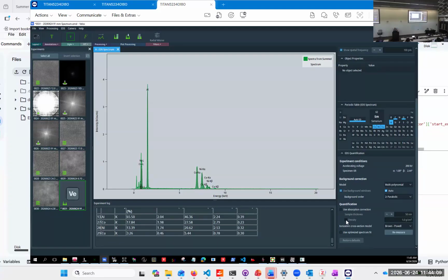There is actually a sample thickness and density, right? So do the same absorption correction I do. You just calculate, called trigonometry, right? We are very well versed now in trigonometry from diffraction. The beam comes down, it goes to the detector. You have to get that angle to calculate this length, and you need to have the thickness. You can put in a thickness here, and then it will calculate it for you. So it's the same absorption that we do there.